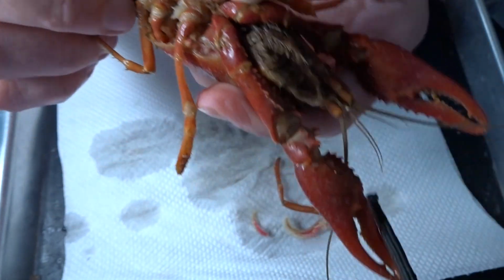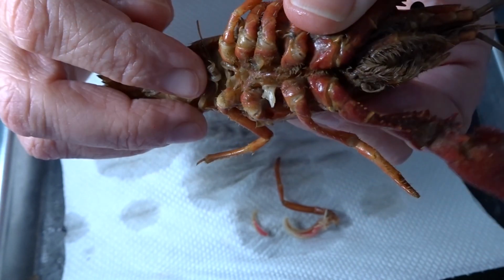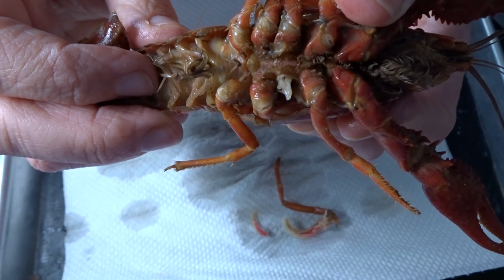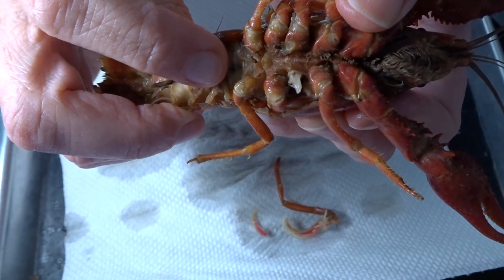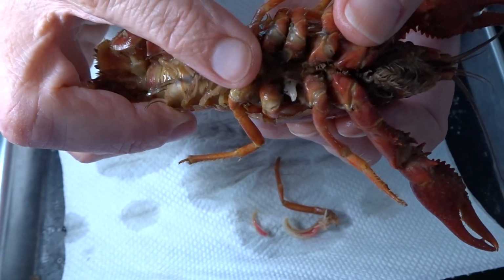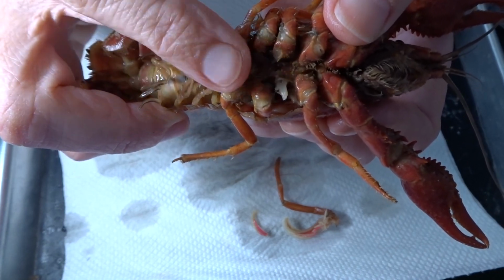Now up here, in the male, they look like another set of walking legs. Maybe if I dig through my bag of crayfish on the back porch, I would find a male. But right up in here, we would have what are called gonopods. Think gonads, those reproductive structures. Pod, that's feet.